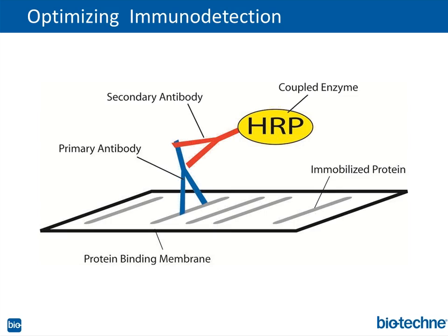So what are the variables in immunodetection? We all know this, right? You have to find an appropriate blocking solution. Then you have your primary antibody, and hopefully they all come from R&D Systems and Novus, of course. Ha ha ha, I'm just kidding. No, I'm not. But I will introduce antibodies from us in a moment or two. And then, of course, consider the detection system. We've got colorimetric, chemiluminescent, fluorescent, as we mentioned.